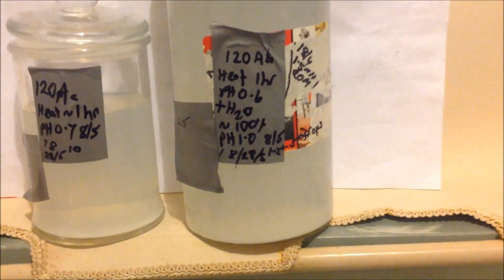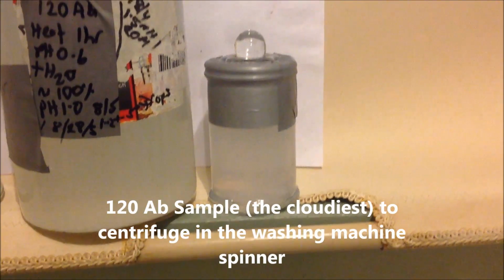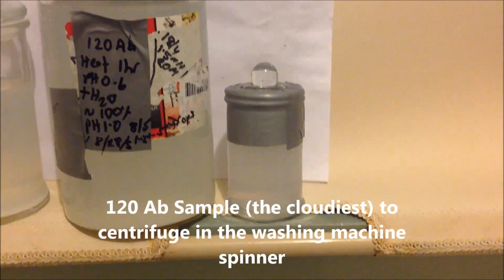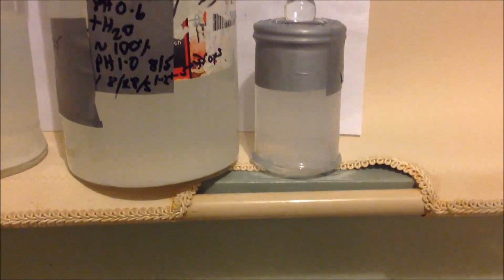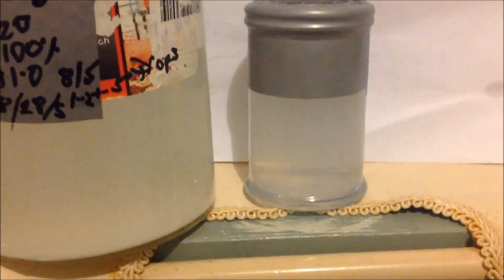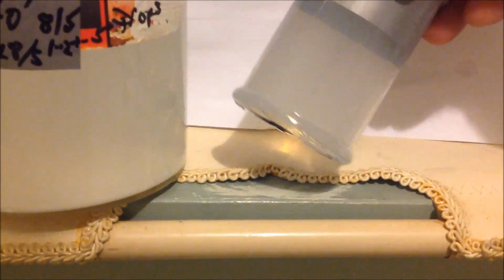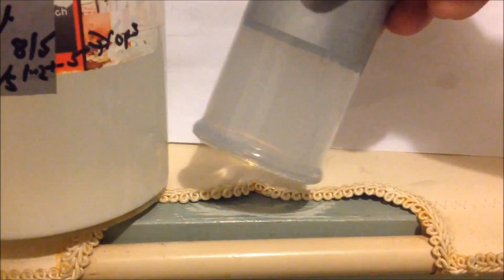I might just try something. I might just pull some of that out and centrifuge it. There's our little sample. Just dunked it in there and dried it off, and I've taped the top shut just so there's no nasty accidents. You can just see the paper line through the bottom, and there's no precipitate in that jar. I've centrifuged it twice and it just doesn't look any different to me. I can't see any precipitate on the bottom.